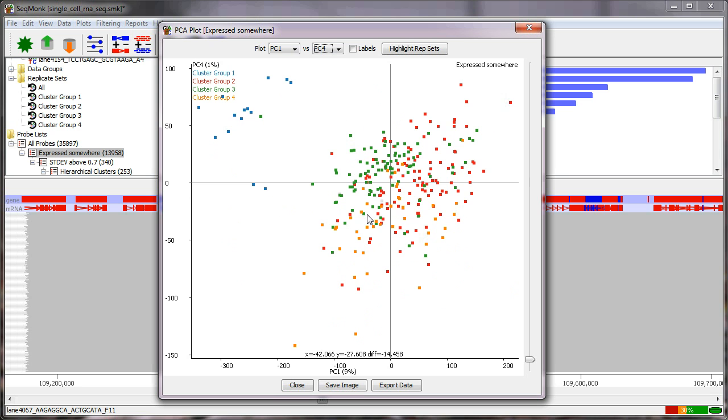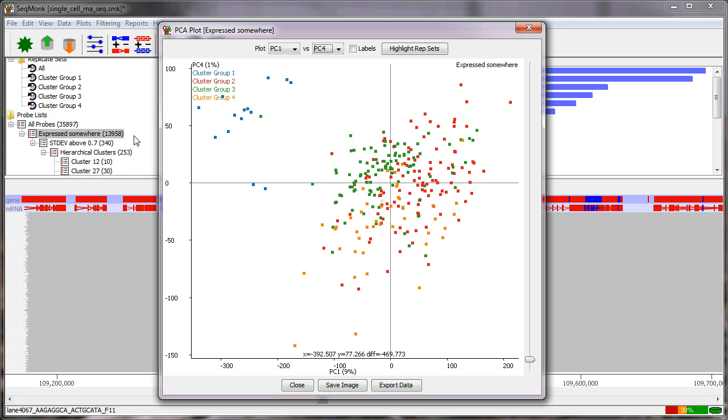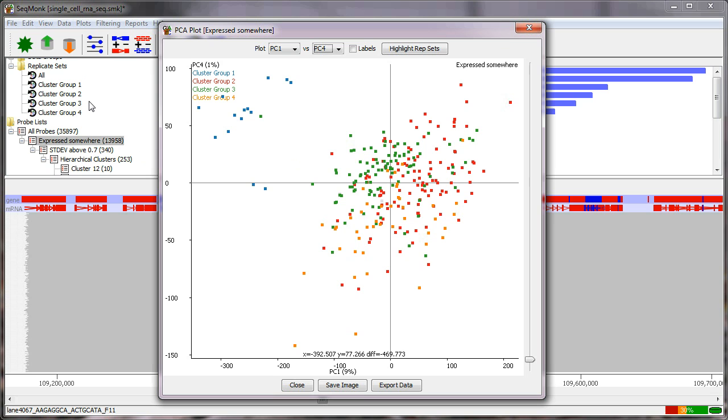And now once we've got these sets we can start investigating these individually, and if we want to dig into this analysis some more, we now have the groups of cells that we can start looking at to see how they behave and what might be different about those, and to characterize the groups of genes against groups of cells. Okay. That's a bit beyond the scope of this particular video, but hopefully this has given you a feel for how you can actually start getting into these data sets and understanding what can be quite complex biological questions.